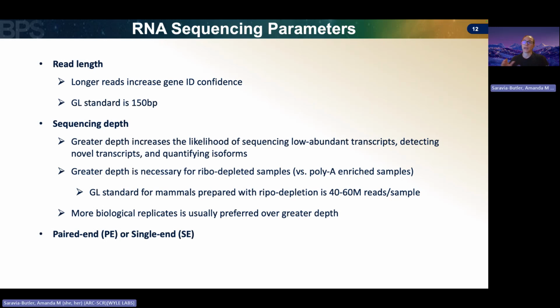And paired end is often preferred over single end. And this is because, as we talked about in the GL4U intro module set, the efficiency, or the quality, of shorter reads is going to be better than longer reads, because as you increase the amount of sequencing, the efficiency of your enzyme will reduce, and the quality will reduce the longer your read is.